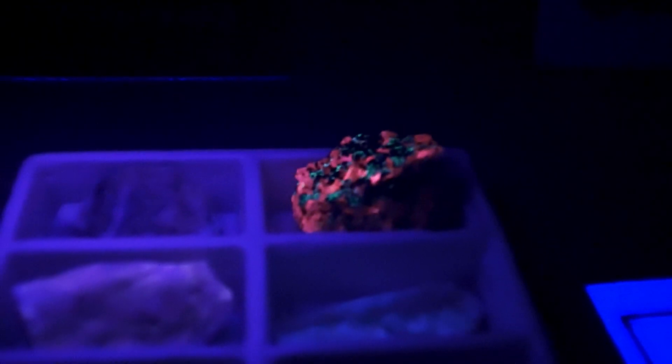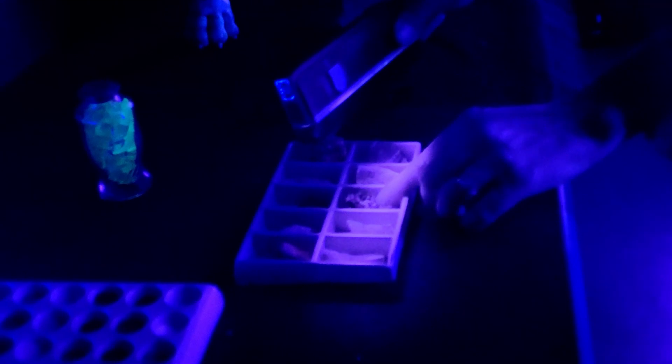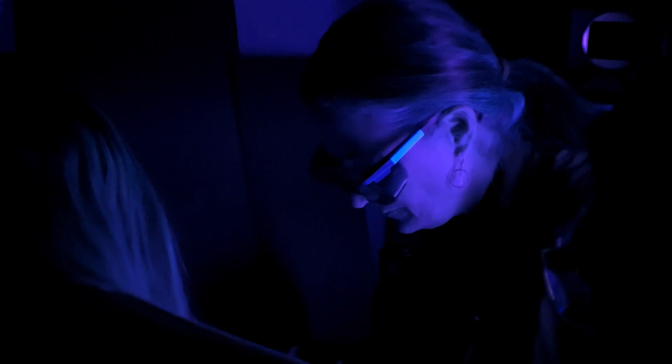Industrial blacklights have been made to help us with illuminating UV in a way that can make materials either fluoresce, or sometimes they absorb the light and you don't see any fluorescence whatsoever.